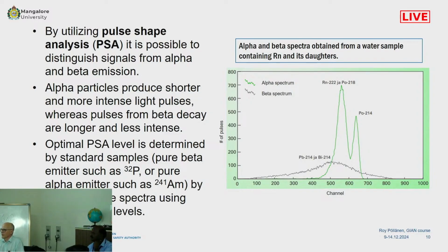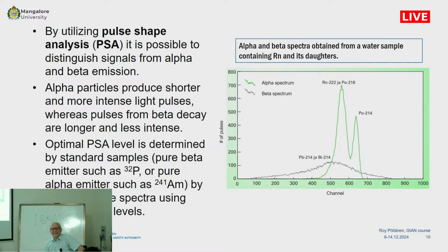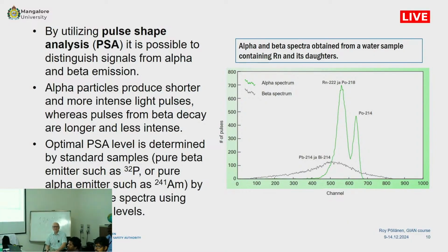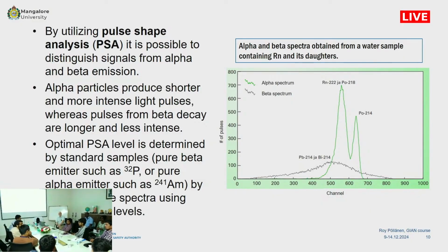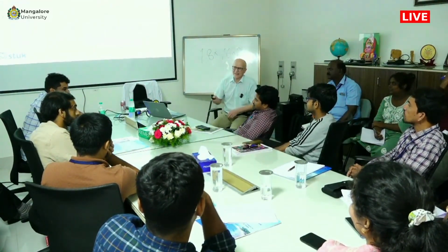Well, you can ask Aria. Vials, but you are changing the vial. The plastic might attenuate, but we are not reusing that. For each sample, you have to use a new one. Plastic might attenuate the polonium, right? So I don't know how you use. I don't have special experience in this area, we can skip the question for the next one.